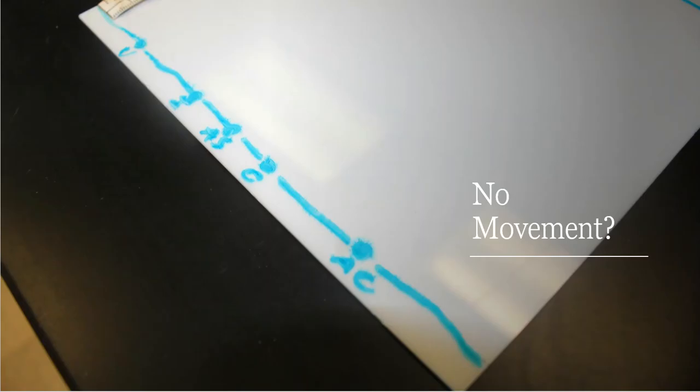All right. Here's just another image of the spots that are down here at the very bottom. Again, they did not move. Not one of them. They did not move. Once I marked the plate and took it off of it, I did not circle anything other than the spots that they started with in the very beginning.